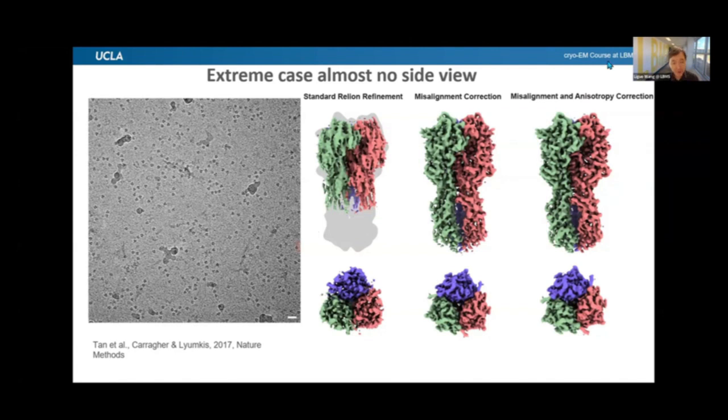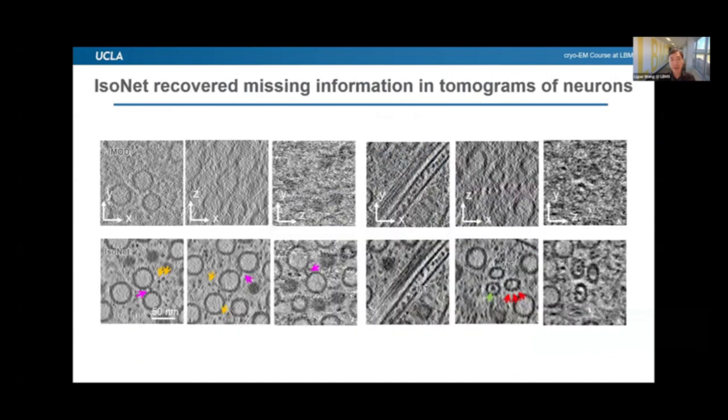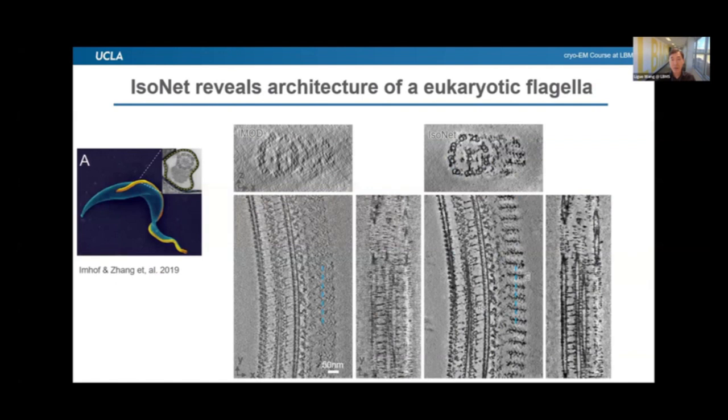Yuntao, thank you for such a great talk. I have two questions. The first one is, it's really amazing to see the comparison of the tomogram from IMOD or from IsoNet. So I'm wondering, if you just do the denoising without doing the filling of the missing wedge information, how will that change?